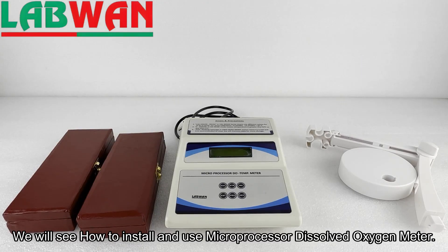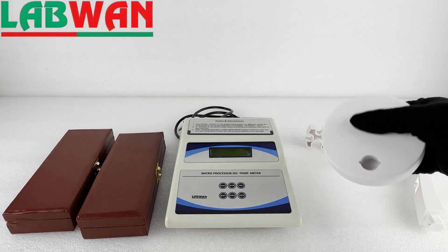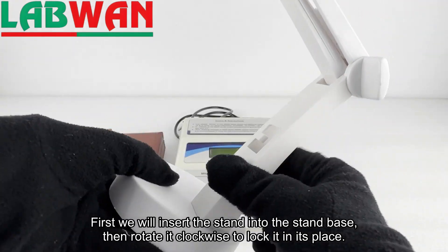We will see how to install and use a microprocessor dissolved oxygen meter. First we will insert the stand into the stand base, then rotate it clockwise to lock it in its place.